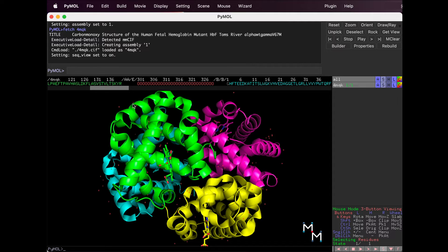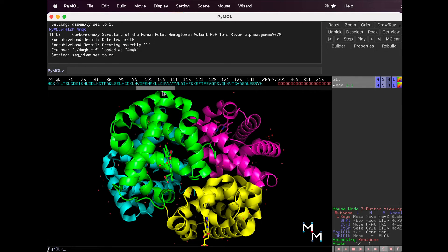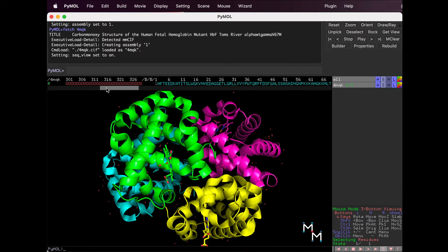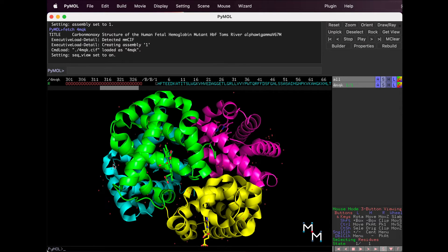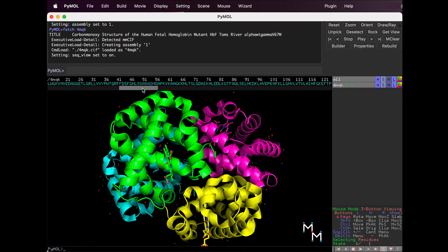Continue scrolling and we find chain B. Notice it's colored the same as in the structure below, making it easy to identify.